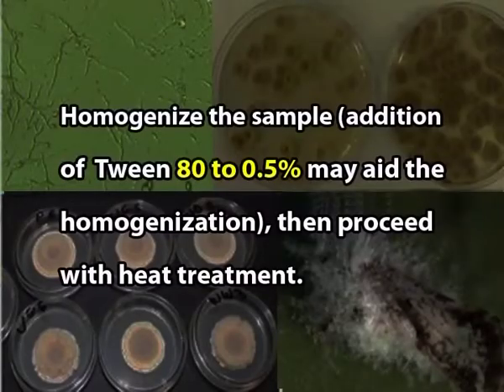Isolation. After arrival to the laboratory, each sample is divided into different lots and each lot is added to screw capped tubes containing 10 ml sterile water. For insect samples, place the insect into tubes containing 1 ml of sterile water per 0.2 to 0.4 gram of insect. Homogenize the sample, then proceed with heat treatment.